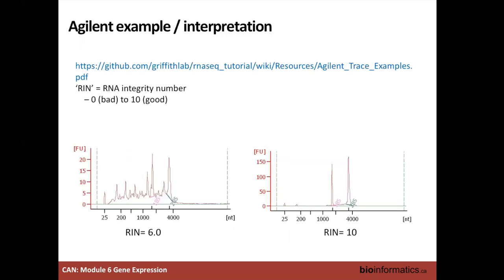One of the first things you need to check is the quality of the RNA in your samples. One measure is the RNA Integrity Number (RIN) from the bioanalyzer. A maximum quality sample has a RIN of 10, showing two large peaks of ribosomal RNA. A RIN of 6 means you have a lot of smaller RNA fragments, indicating RNA degradation. We typically require a RIN of 7 or above to generate RNA-seq data, though we might go lower for a very precious sample, knowing that quality may suffer.